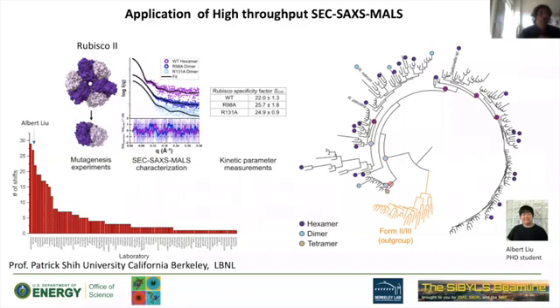It's much more difficult for us to run different buffer conditions because we need to equilibrate all the time, and equilibration is the time-consuming step in SEC-SAXS. But if you have different mutants, constructs, different proteins or complexes, you're welcome to send more than 2, 3 samples. So far, the limit is about 7, I believe, on our mailing page to give in one slot. If you want more, just ask Catherine and we'll discuss the possibility of giving you 2, 3 slots. I mean, there's no limit if there are open slots for the users.